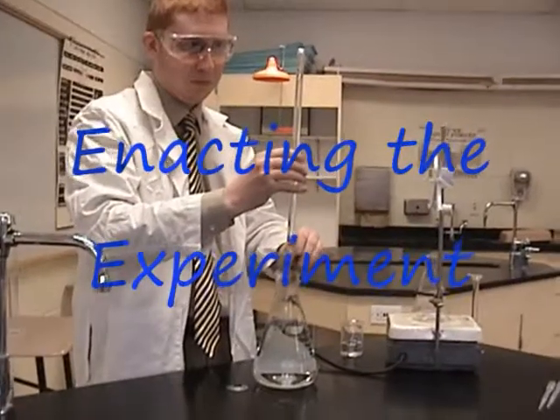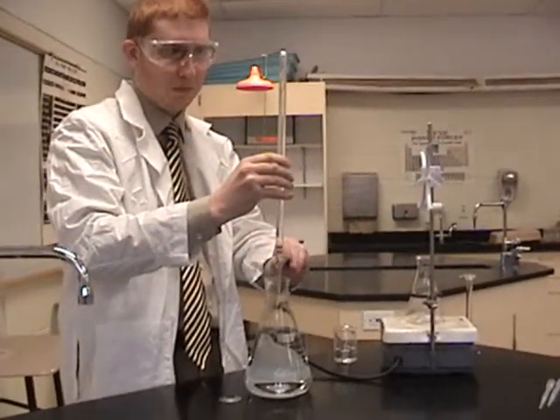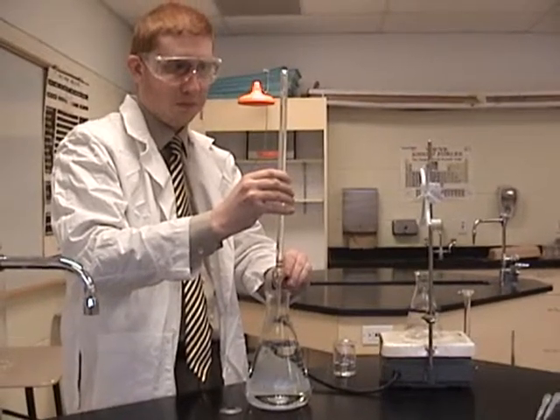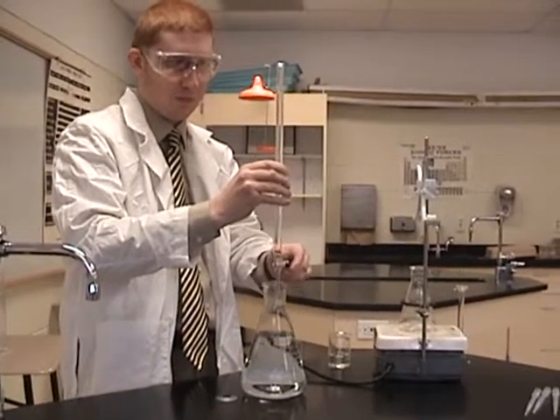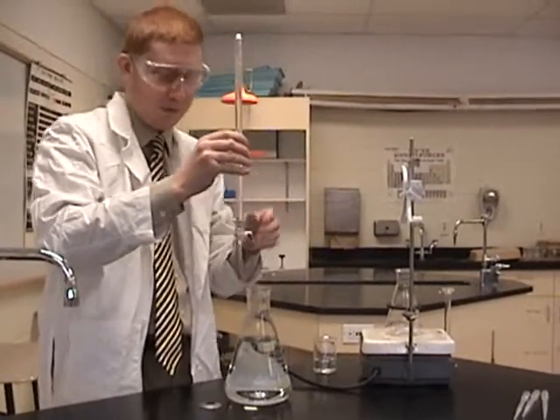The first step in the experiment is to fill your burette with the sodium hydroxide solution. Make sure the meniscus of the solution is on exactly zero milliliters before you start the experiment. Then place the burette above the solution you want to titrate.